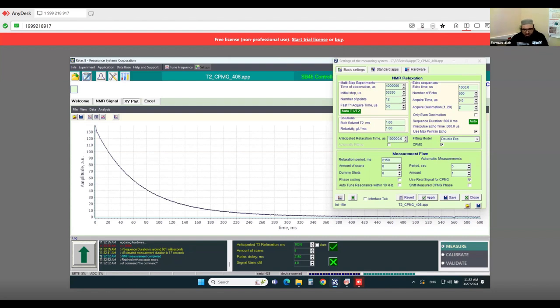Okay, so this is something which, if you have an unknown sample, you will play with, and you will finally find your results. So next, I'm going to save this result.